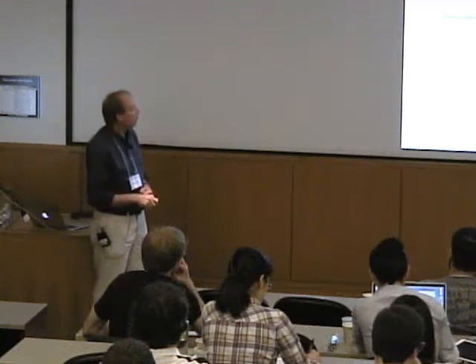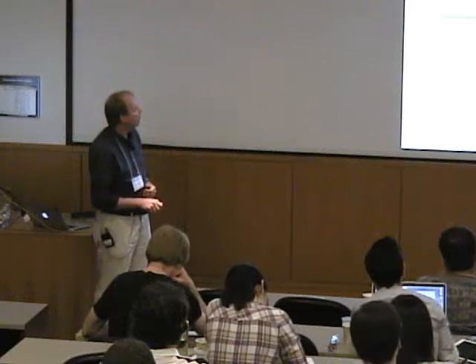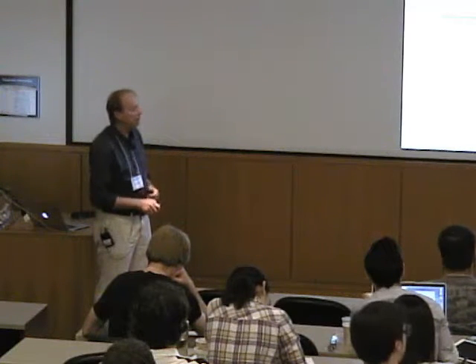So at this point. And the idea is that if we then have an EPR transition occur under those conditions, then we disturb the critical coupling away from this point, and we get reflected power back out of the resonator. And that reflected power that we measure is greater than what you would measure in a direct absorbance experiment, right? And so we get an amplification of the signal.